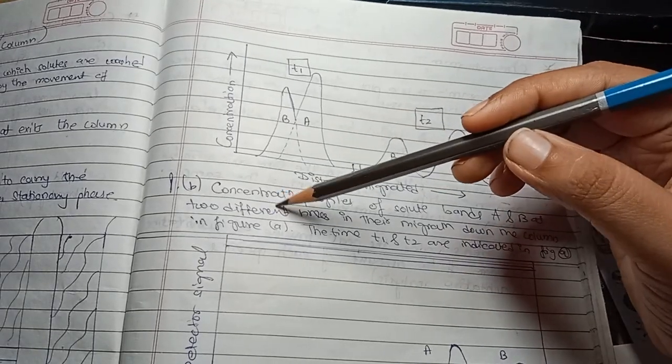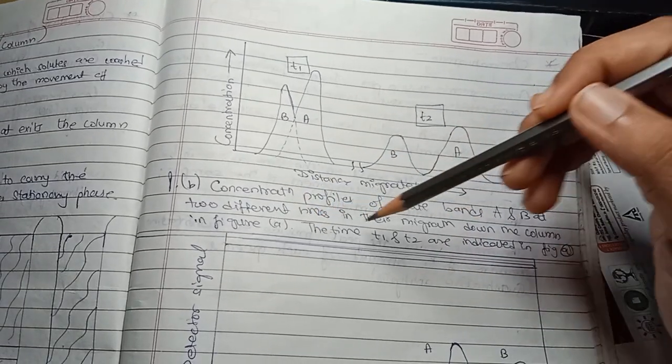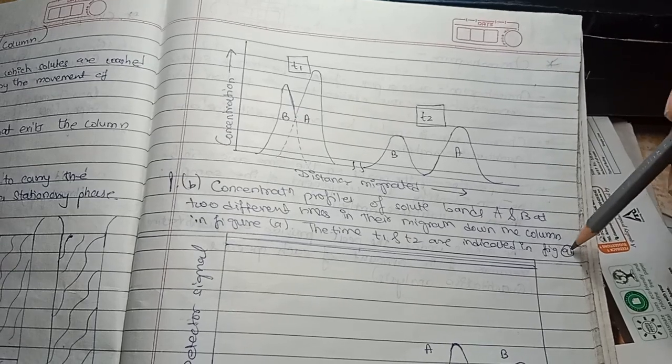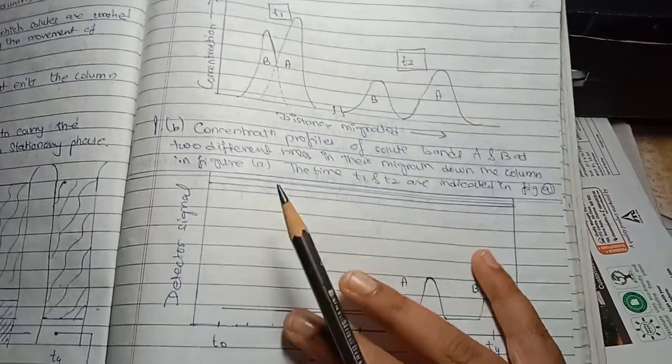So this is the concentration profile of a solute. Bands A and B at two different times in their migration down the column in figure A. The times T1 and T2 are indicated in figure A. Now, here is another graph.